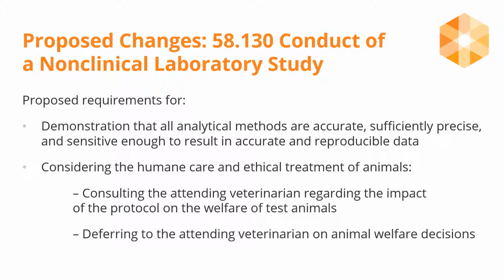One big change has been deferring to the attending veterinarian on animal welfare decisions and consulting the attending veterinarian regarding the impact of the protocol on the welfare of the test subject animals. The analytical methods used must show accuracy, be sufficiently precise, and sensitive enough to result in accurate and reproducible data.